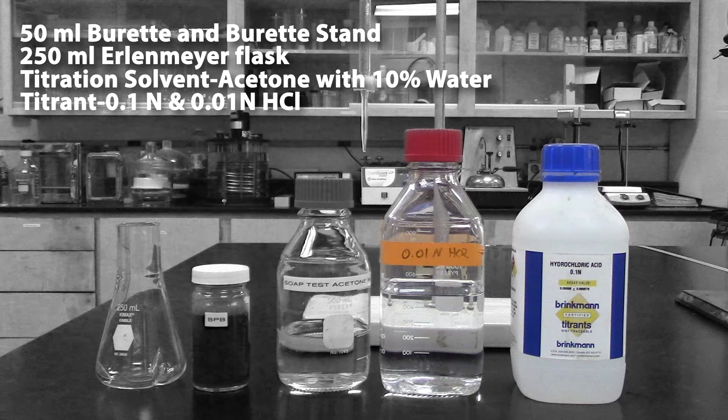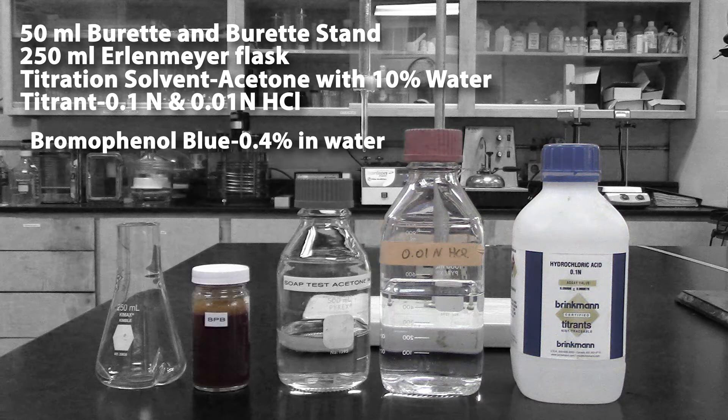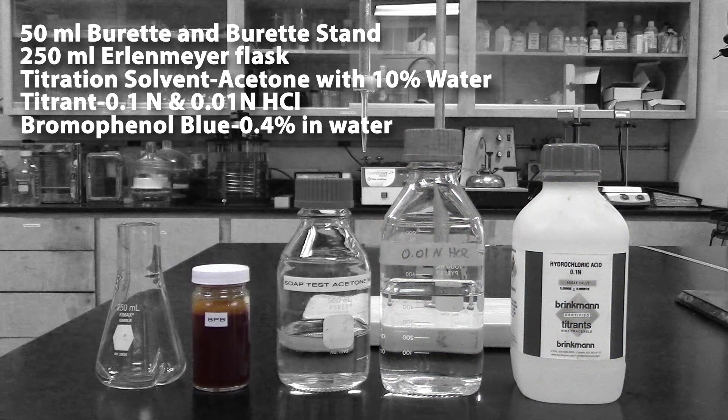The hydrochloric acid titrant can be prepared and standardized or purchased in the proper normality. The color indicator is bromophenol blue, a 0.4% solution in water.